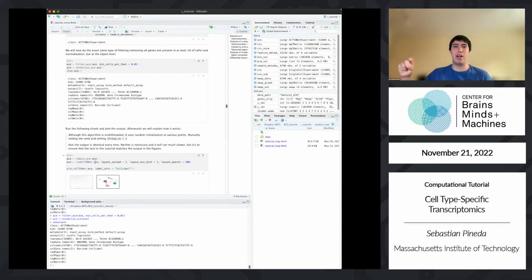But what else is extreme in data? Well, noise, outliers, junk. And this is one of those. It's not a bug, it's a feature, because the algorithm captures those things. It's very easy to just identify it and then remove it. And then whatever's left is true biologically driven variation. So we're going to run that.